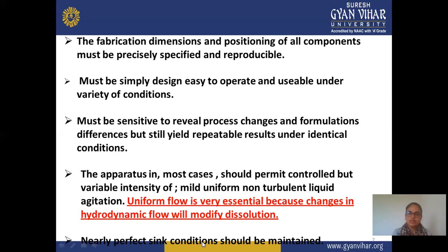Next, it must be simply designed, easy to operate, and usable under a variety of conditions. The construction of this dissolution apparatus is very easy. Anybody can handle it when they know the procedure for performing the dissolution test; specific training is not required. So the design is very simple, and you can easily operate this test, and it is suitable for a variety of conditions, equipment or pH conditions. And next, it must be sensitive to process changes and formulation differences.